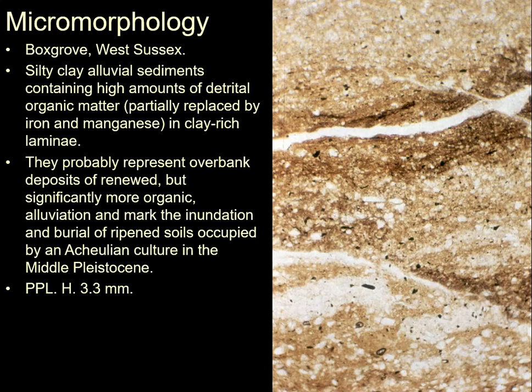This is Boxgrove. Very important archaeological site from the Middle Pleistocene. Acheulean bifaces all over the place. And you can see here basically a sedimentary environment. There don't seem to be any floors in here, just the deposition of the hand axes.